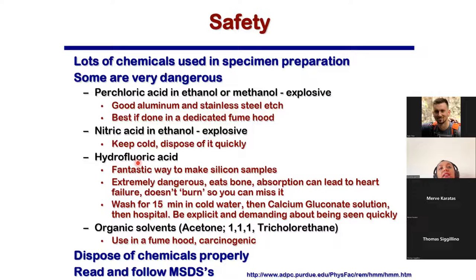Hydrofluoric acid, generally people do not use in our labs, but anyone who is making a silicon sample uses hydrofluoric acid. Extremely dangerous, it can eat bones. Immediate absorption can lead to heart attack. If this acid is used, I know in MSc, people do a lot of study on semiconductors, and they use this acid very, very commonly.